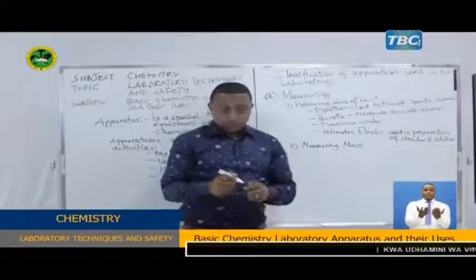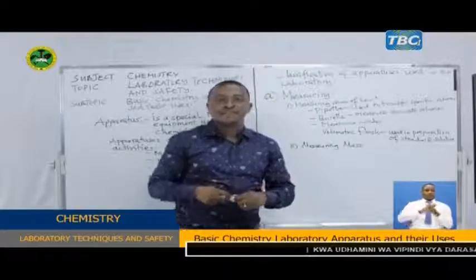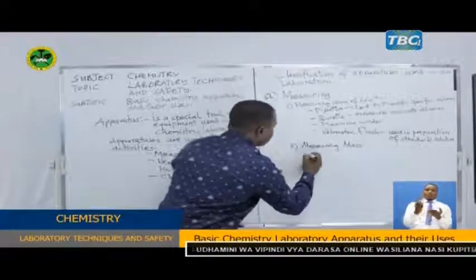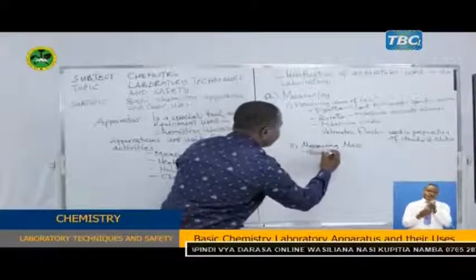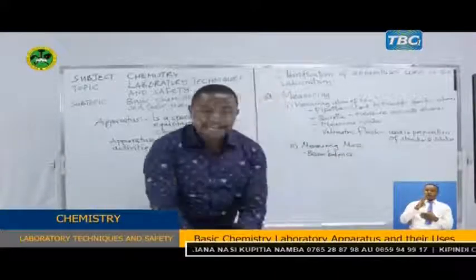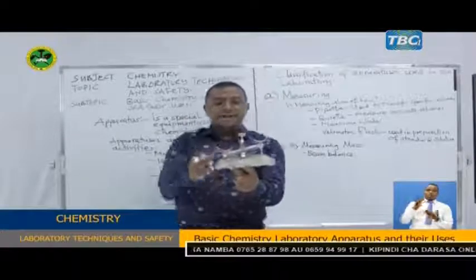The apparatus used in measuring mass is the beam balance. A beam balance is this apparatus here, class.